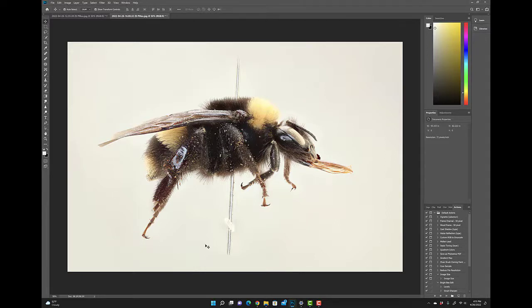All right. Also, I used the clone tool when we were at 3x, and I just want to show people how that works again. So that's this stamp tool. You can see me click that on the left. If I hold down Alt down here on the pin, or even up here, that's a bit better, you can see what I'm doing. I'm sampling this region. And now if I enlarge the area where I'm brushing, I can then copy or replicate that area in order to remove different areas or different parts.